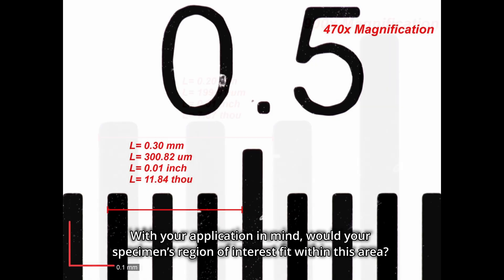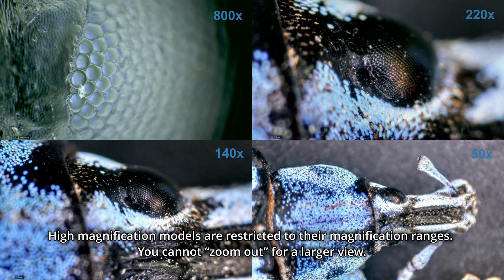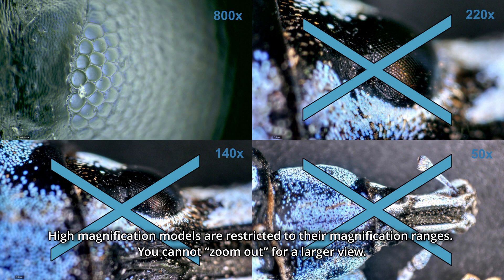With your application in mind, would your specimen's region of interest fit within this area? High magnification models are restricted to their magnification ranges. You cannot zoom out for a larger view.